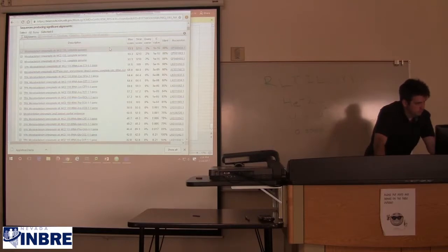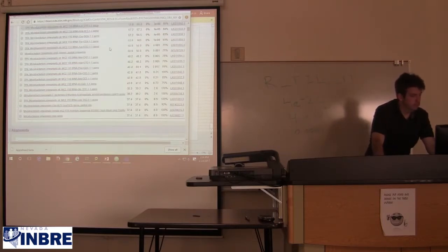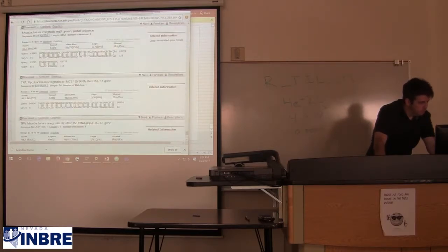That's what's showing up, mostly tRNAs. Well, because that's the idea, that's where they're getting them from. Yeah, and it looks like perhaps this is a partial sequence to the ARG-S operon. But of course, the scores aren't very good.